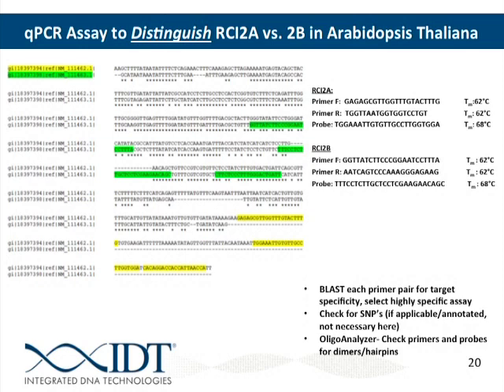So, start with our forward primer. In looking at these in OligoAnalyzer, we want to set the divalent salt and dNTP concentration similar to what is actually going to be in our reaction. So we can change these, and that'll give us a more accurate representation of what the melting temperature for this oligo is going to be.